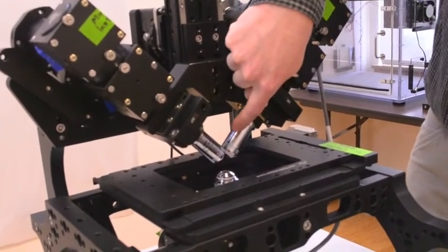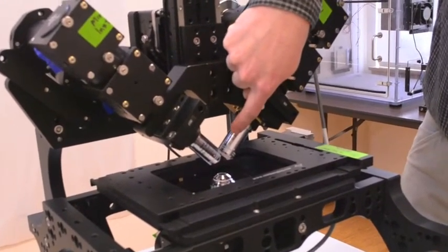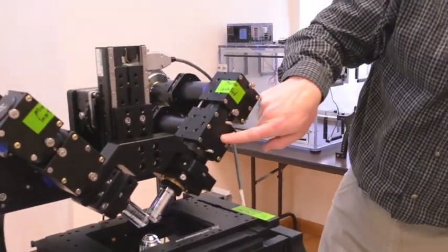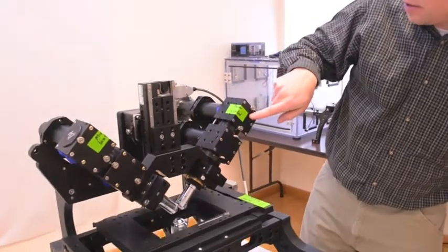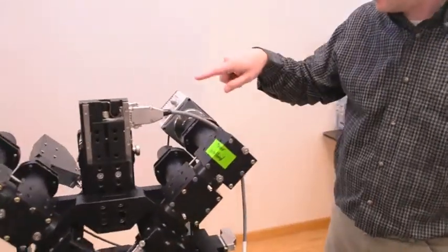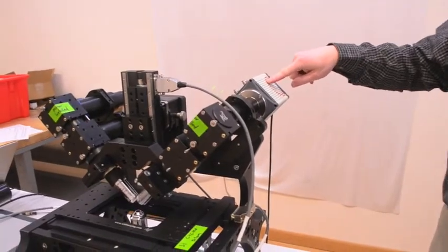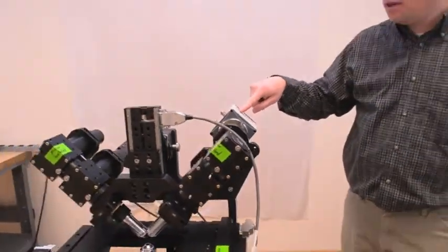So the light sheet is generated by this objective, and then the objective on the right is focused on the illumination plane. And whatever fluorescent light is emitted is collected by this objective, passes through the dichroic mirror in this cube, and in this cube is reflected back to the camera on the right side. So that's one of the two imaging paths.